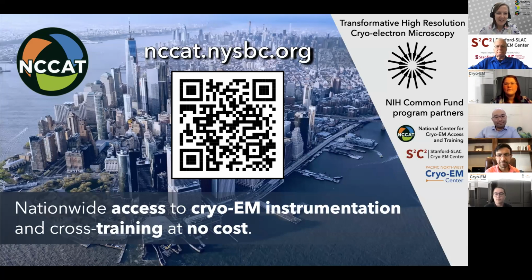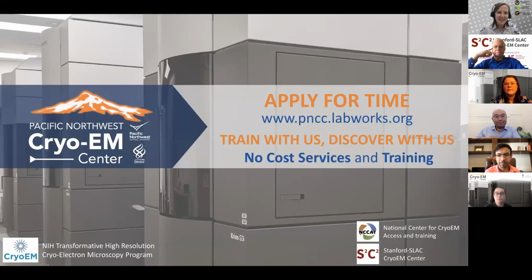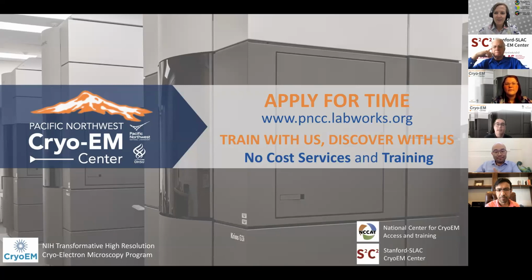Thank you, Ed. Theo, you are up next. Hello, everyone. My name is Theo Humphreys, and I work as a scientific point of contact for the Pacific Northwest Cryo-EM Center, or PNCC. At this time, we offer 1 proposal type for both single particle analysis and tomography, and that grants you up to 480 hours of microscope time a year for up to 2 years. At the PNCC, we have a monthly submission deadline for applications, and each approved proposal will be delegated a scientific point of contact, such as myself, to help answer scientific questions.